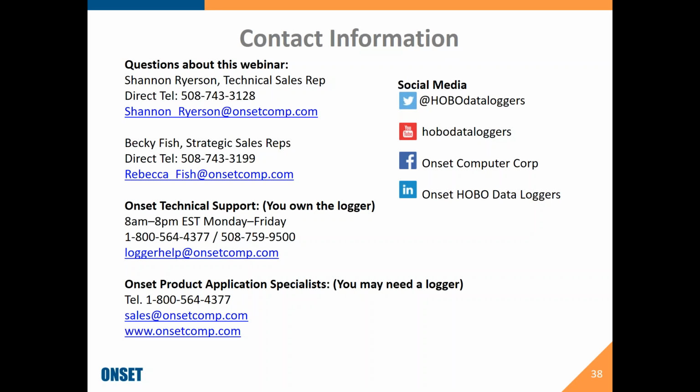For the analog channels, you have a maximum capacity of 8 per RX3000. So that means that you could have a third-party DO sensor, a third-party water level sensor, a third-party pH sensor, and up to 5 more sensors connected into the analog modules on the system, in addition to up to 15 smart sensors. Keep in mind that the pulse input adapter is a smart sensor for us, so that's going to occupy one of those regular 15 smart sensor channels if you are using a third-party sensor that has a pulse output.